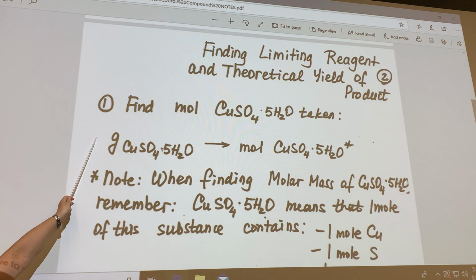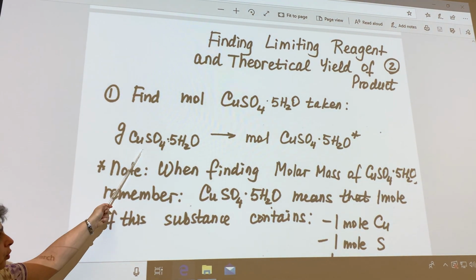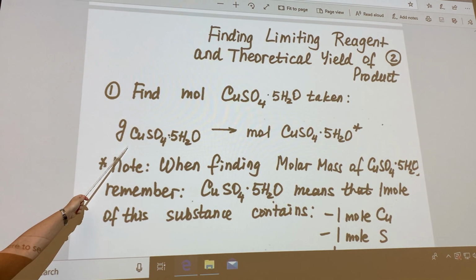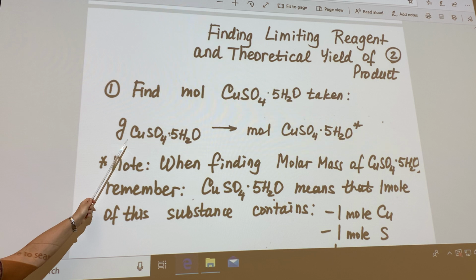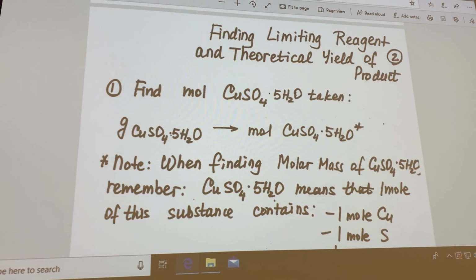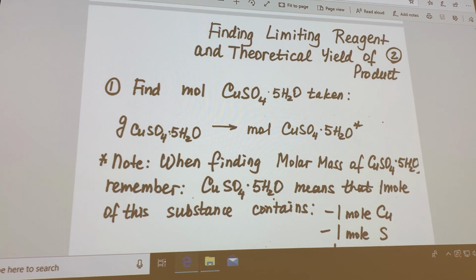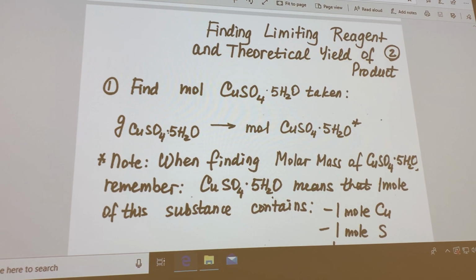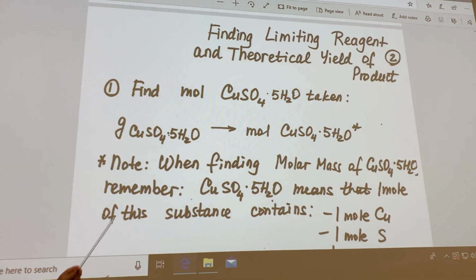You will, like I mentioned, weigh the recommended amount of copper sulfate, and you'll record it onto data sheet 1. Make sure to record the mass of copper sulfate you use with the proper number of significant figures. Remember, our balances weigh to the nearest milligram, so you need to have 3 digits after the decimal for the mass of copper sulfate. The mass will be given approximately in the directions.